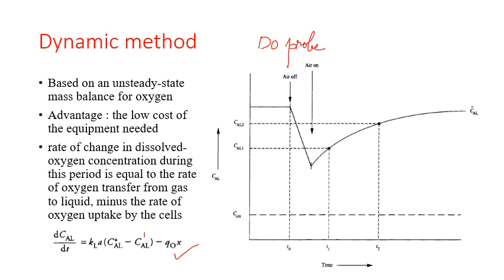Now, how you perform this experiment can be explained by means of the diagram that is shown here. What exactly you do here is you let a reactor run. So you have a reactor here, with inoculum, or you have broth with microorganisms in it already growing.